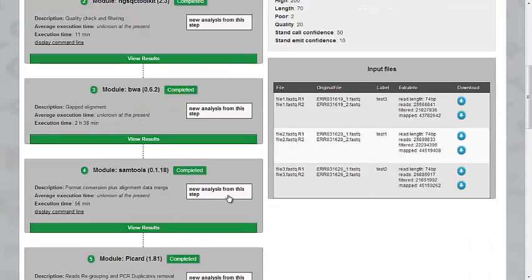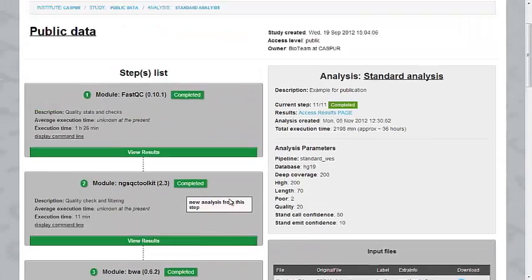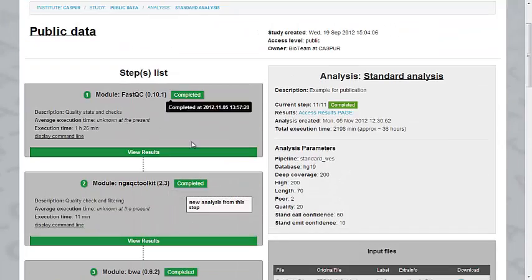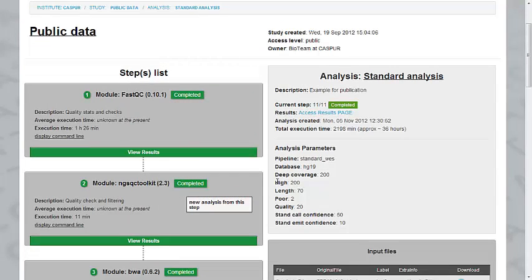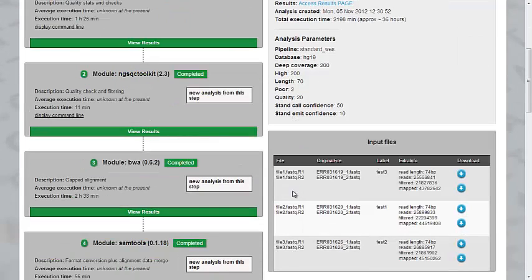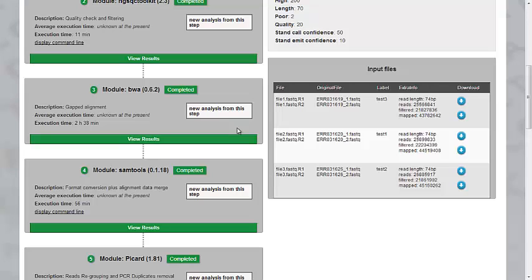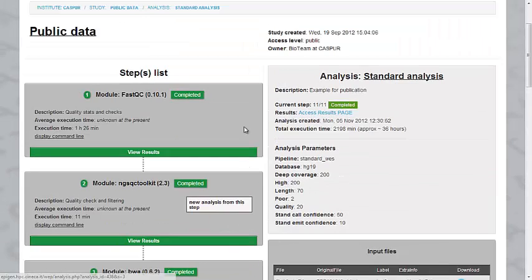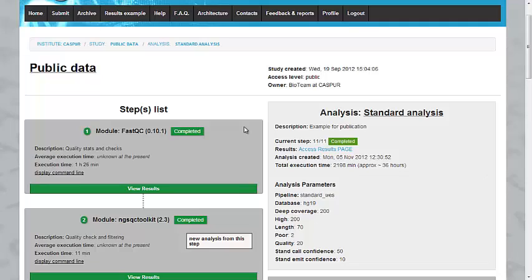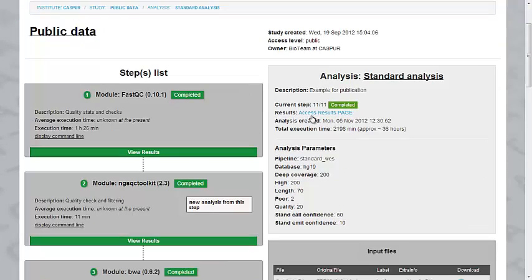And here we have all the steps that are labeled in green because they are completed. And you can restart a new analysis from any of these steps with different parameters, for instance. Or access the results page.